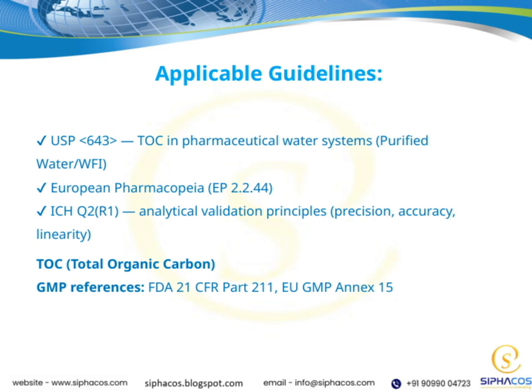When we talk about TOC, we're referring to total organic carbon, which is a critical parameter in assessing water purity. Monitoring TOC levels helps us detect any organic contaminants that could compromise product quality. Additionally, we should be aware of GMP references, such as FDA 21 CFR Part 211 and EU GMP Annex 15.